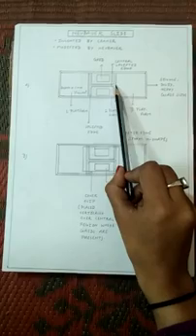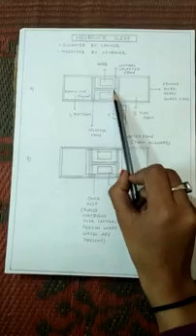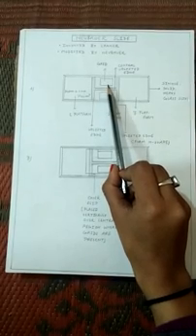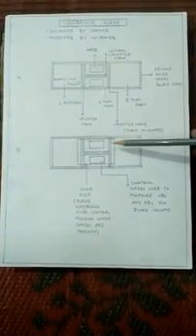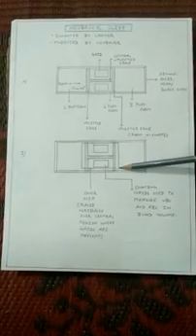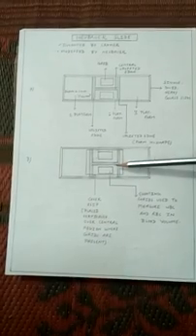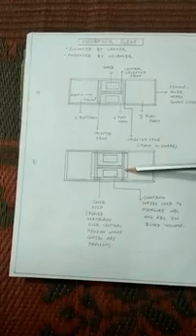And due to this central uplifted edge, the second platform is further divided into two columns, and these columns have grids. You can see this is a square-like structure which is called a grid. Why is it called a grid? It is called a grid because it has measurements which are used to measure the number of WBCs and RBCs in human blood. Friends, you can see in this diagram, if we assume that these outlines are the cover slip, then this cover slip is put above this uplifted edge. So we can say that this uplifted edge is used to put the cover slip over it.